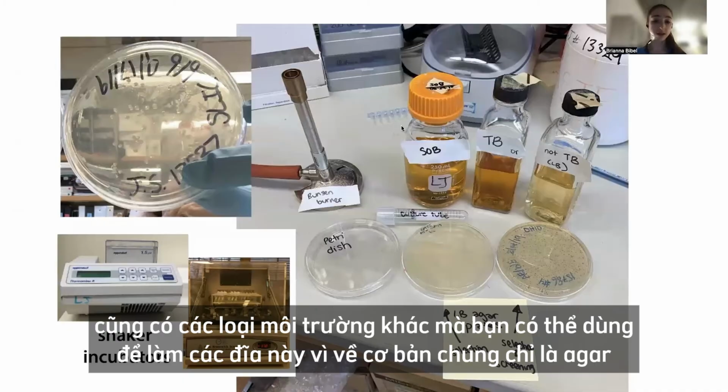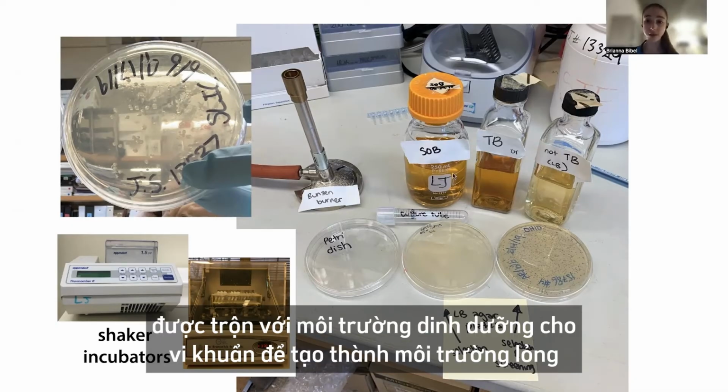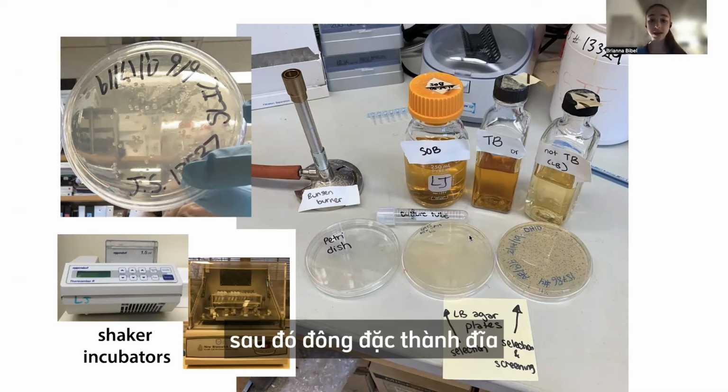There are other types of bacteria food that you can use too, and that you can make in these plates, because basically it's just this agar, so it's like this sugar that we mix with this bacteria food that we can make as this liquid food, and then mix it in with that, and then make these plates. And we'll talk about that more in a minute.